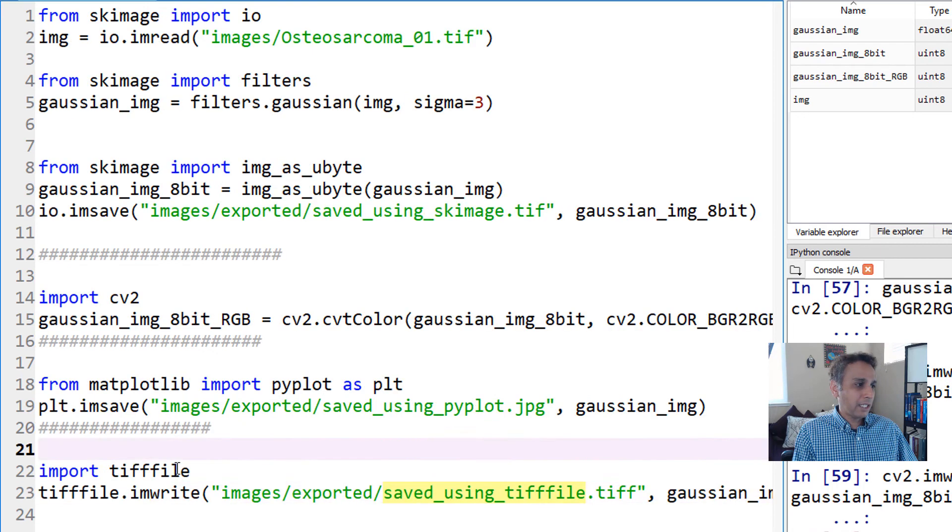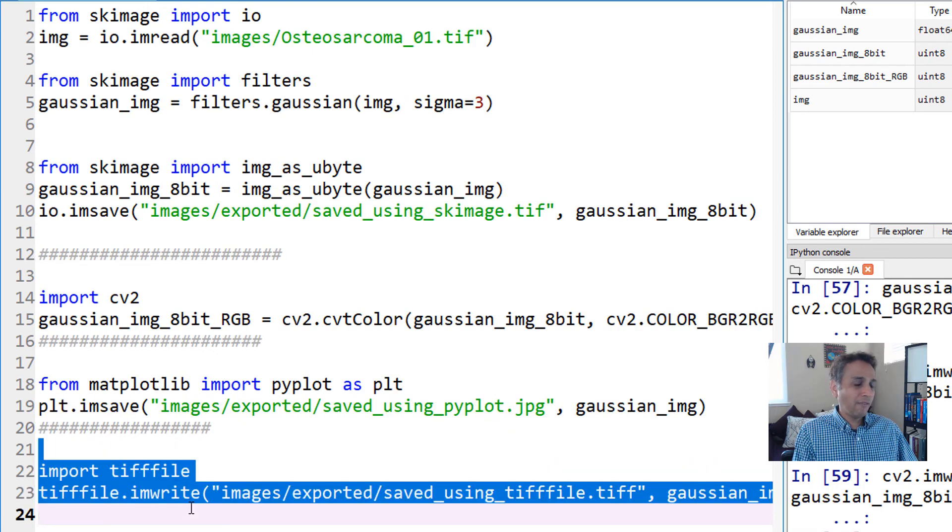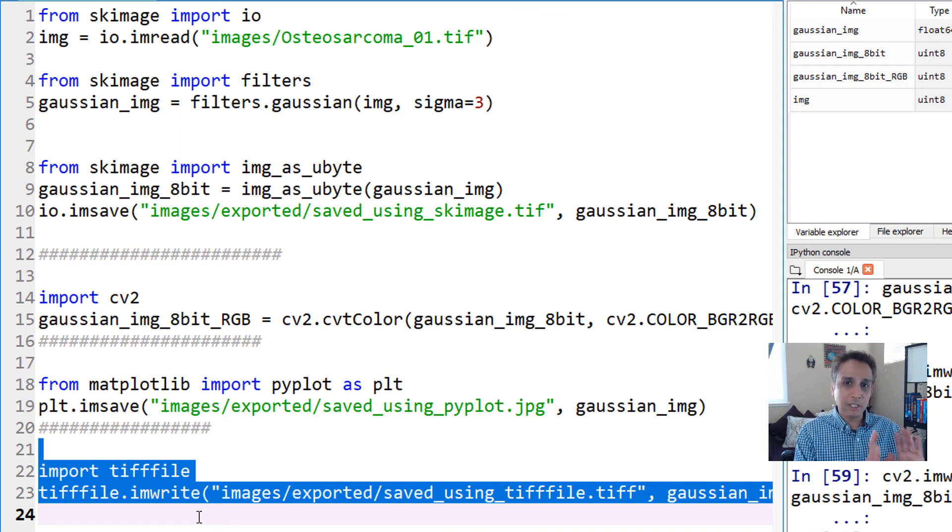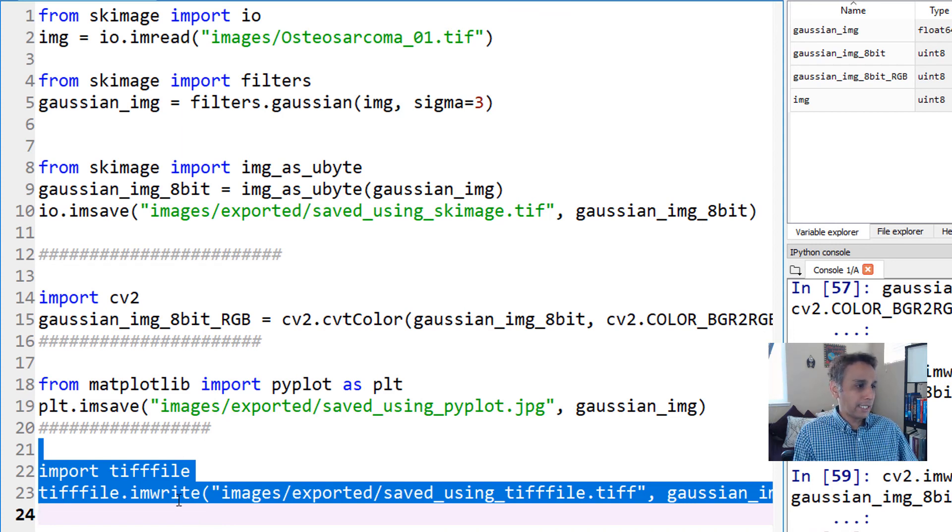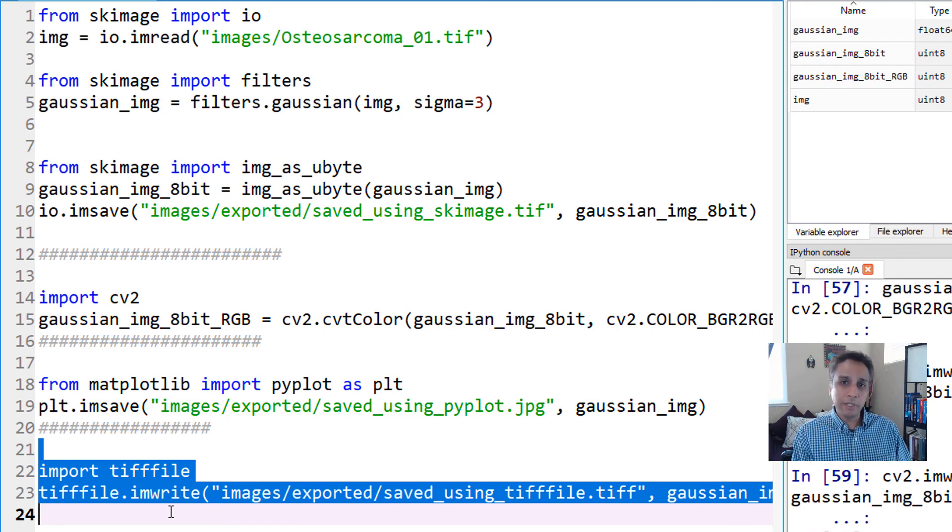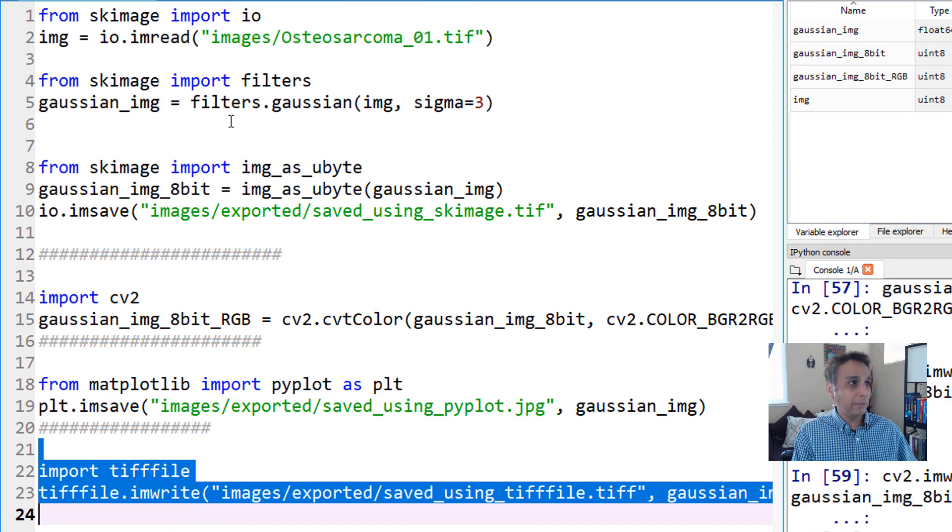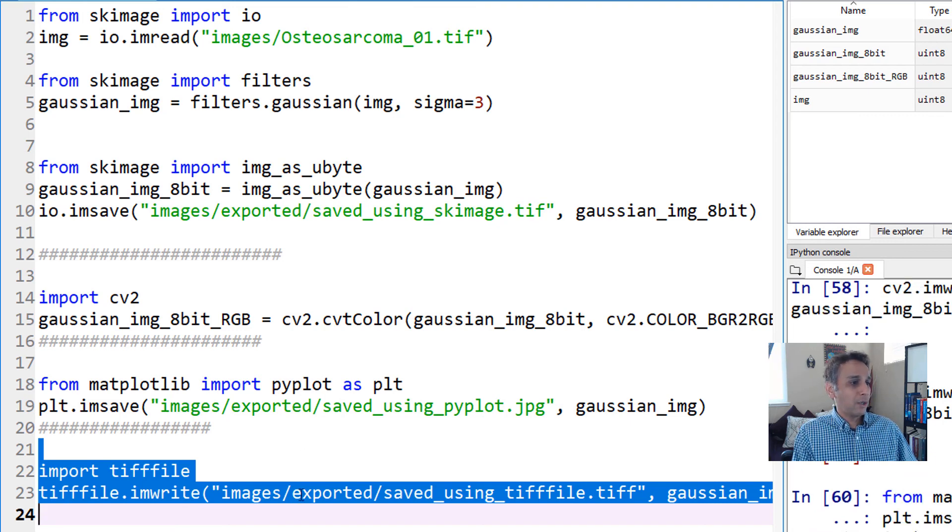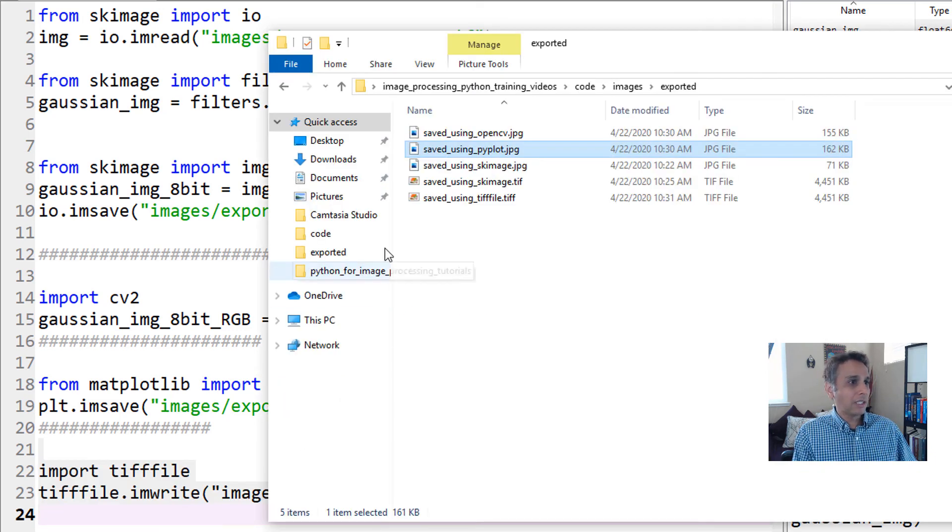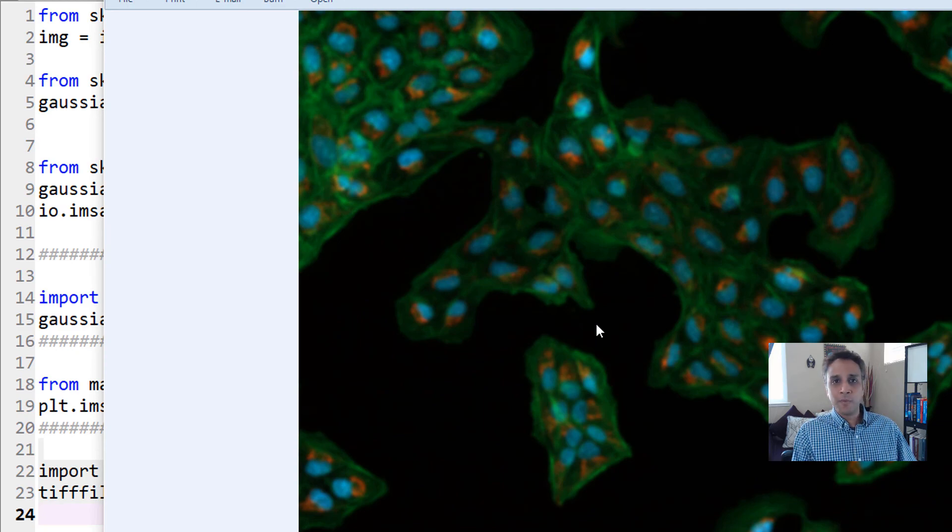Once you have it, you can use tifffile.imwrite. The array we're trying to save is gaussian_img_8bit. tifffile has no issue with BGR or RGB, but you have to convert images to 8-bit otherwise they'll look weird. Let's save this and it should look decent.